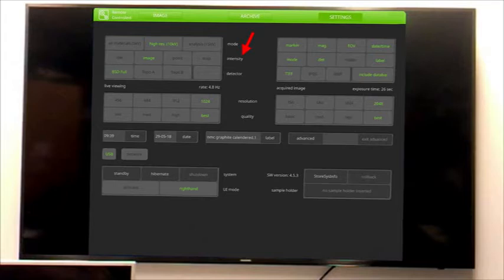In terms of intensity, this is more specifically referring to EDS and some of the various techniques you can do there. First off, there's low intensity. That would be more applicable if you aren't doing any form of EDS and you would rather just take images. Also, the image intensity is usually what I stick with when I do imaging. The low intensity usually doesn't work well for me, so I usually stick with imaging intensity if I'm just doing images. However, if you are planning on doing point maps on your EDS, go ahead and pick the point intensity. That'll improve the resolution that you require. Lastly, if you are planning on doing mapping in your EDS, which we will cover a little bit later, go ahead and select the mapping intensity. That will also work rather well.